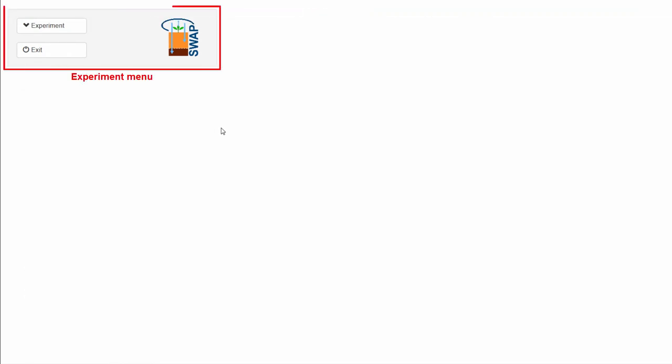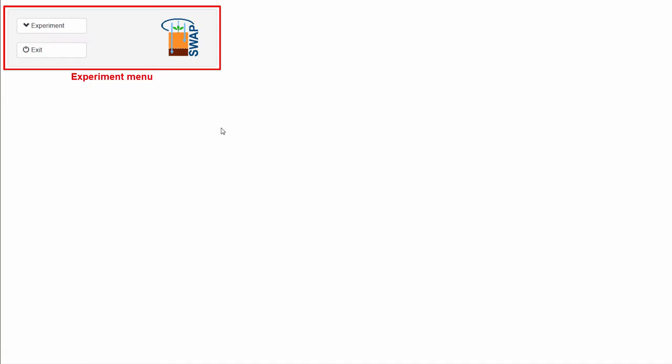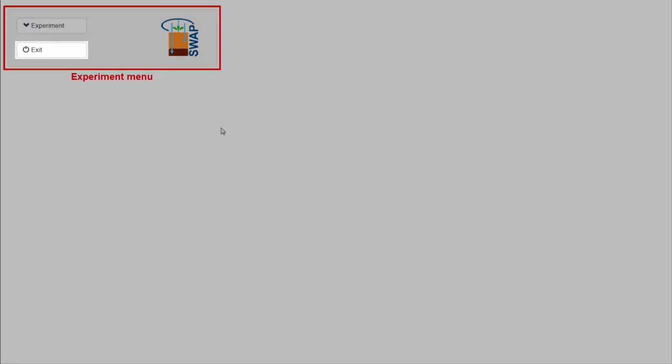In the upper left side of the screen, you will find the experiment menu. Here, you can manage your experiments and close SWAP by selecting EXIT.